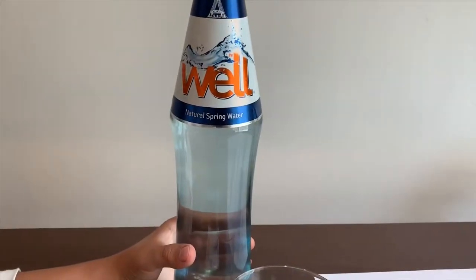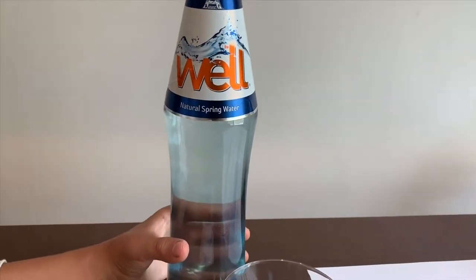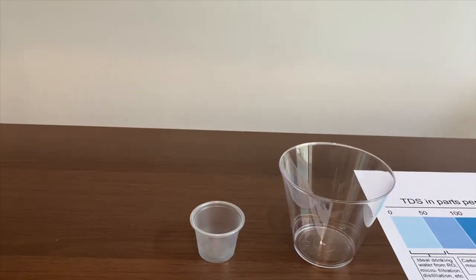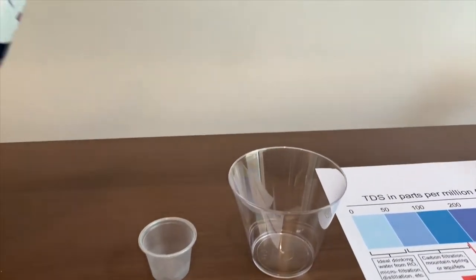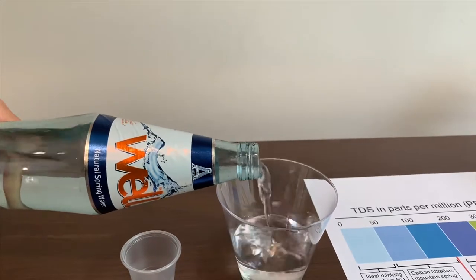This is Ararat Well Natural Spring Water and it's from Armenia and it costs $1.29. First, we're going to test the TDS. After, we're going to test the pH.